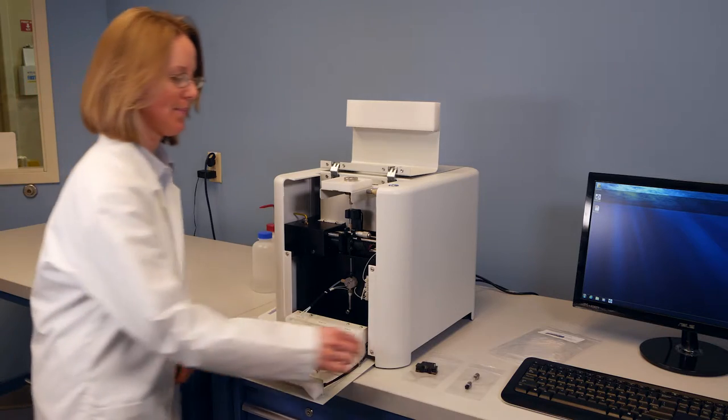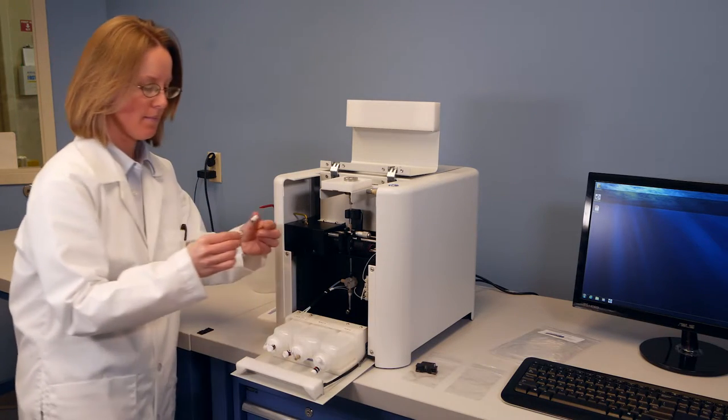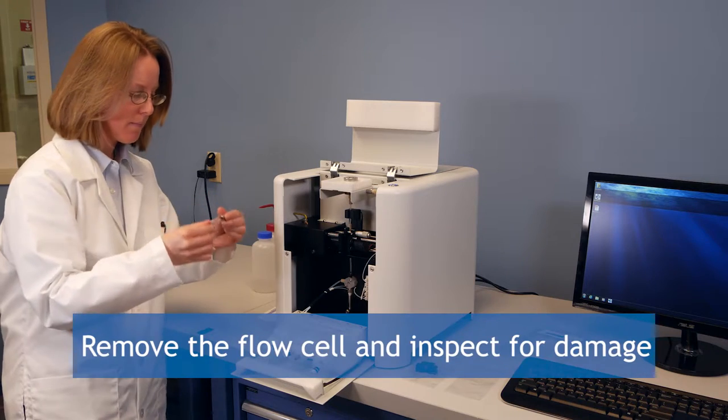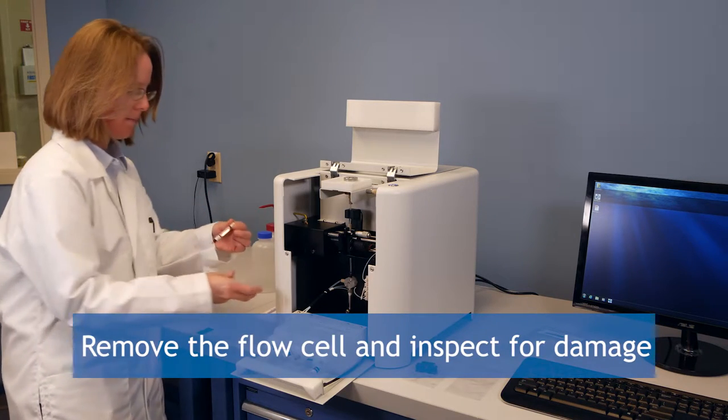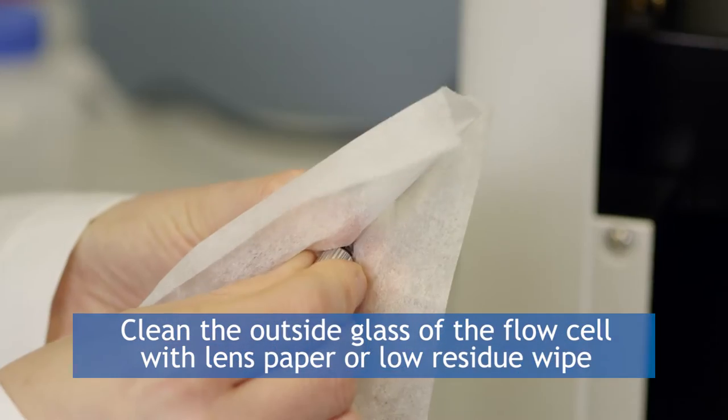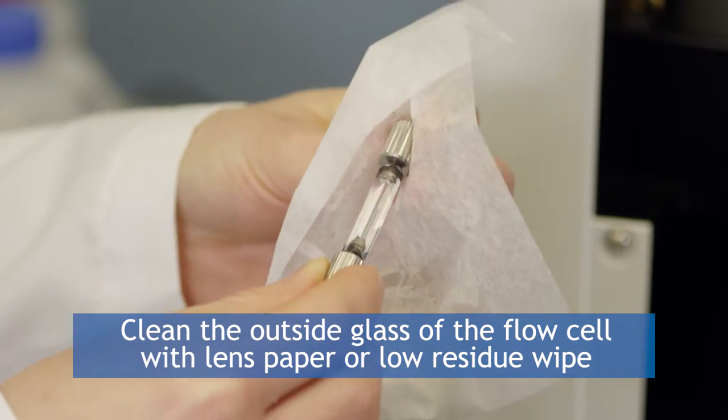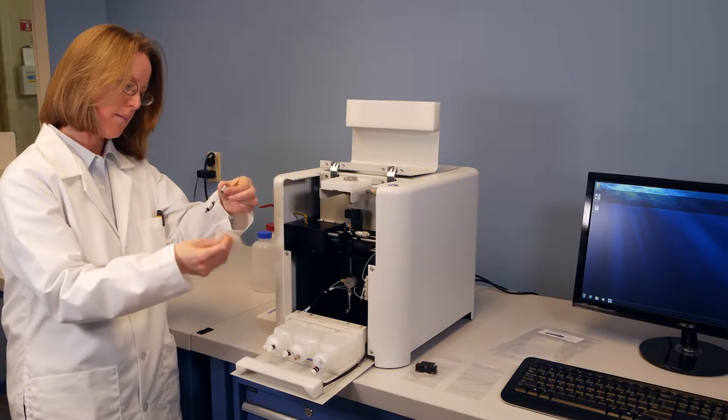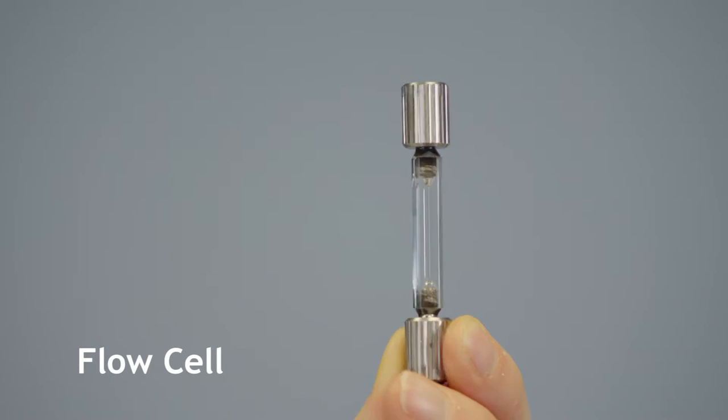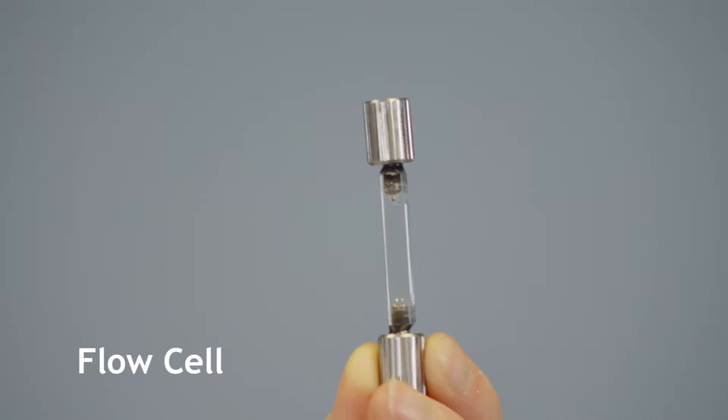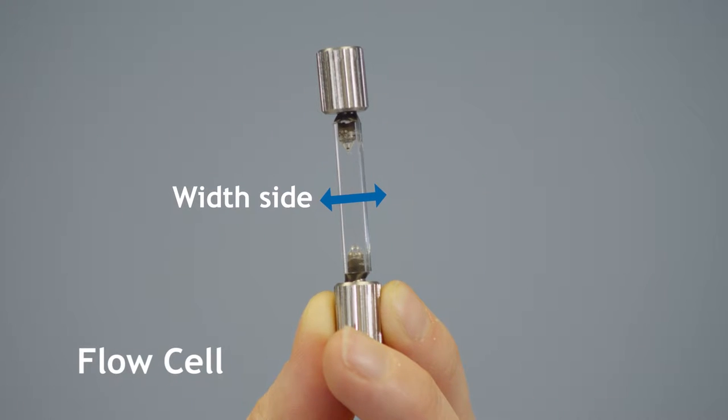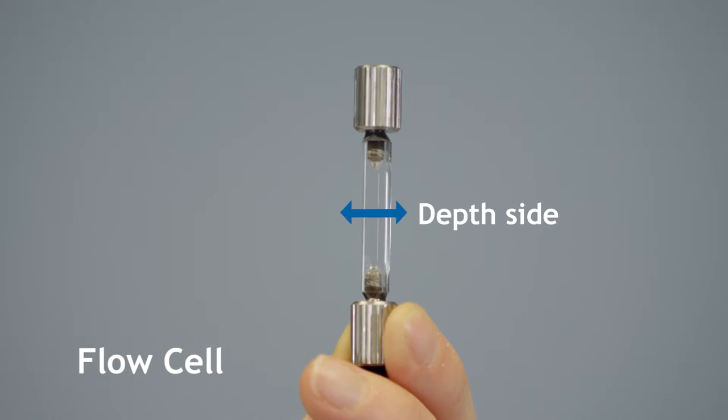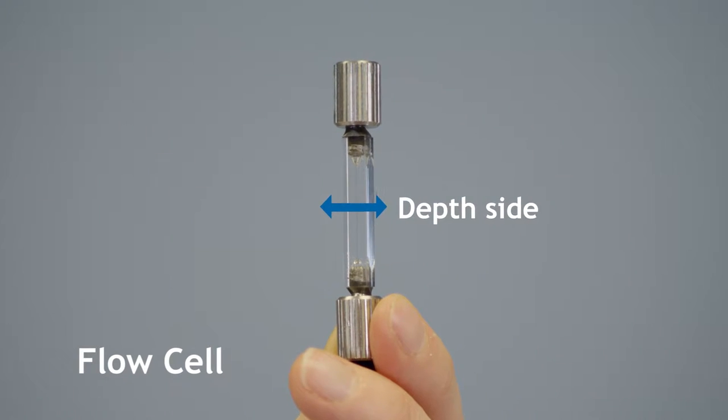Next, you will need to set up the flow cell and associate connections. First, take the flow cell out of the protective packing and inspect it for any damage. Clean the outside glass of the flow cell with a piece of lens paper or low residue wipe to remove any outer particles or fingerprints. Look closely at the flow cell and you will notice that the two cross sections of appearance are different. From one side you will be looking at the width of the flow cell, and the other side you will be seeing the depth of the flow cell, both of which may vary.